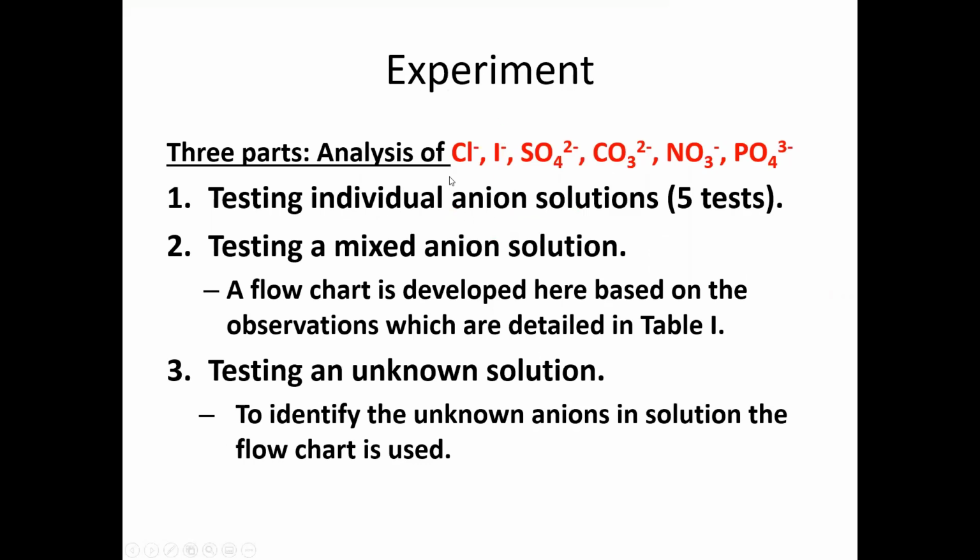So there are 3 parts to this experiment. One is testing individual anion solutions. Second is to test a mixed anion solution. A flowchart is developed here based on the observations, which are detailed in table 1. You'll see that in the template. And then testing an unknown solution.